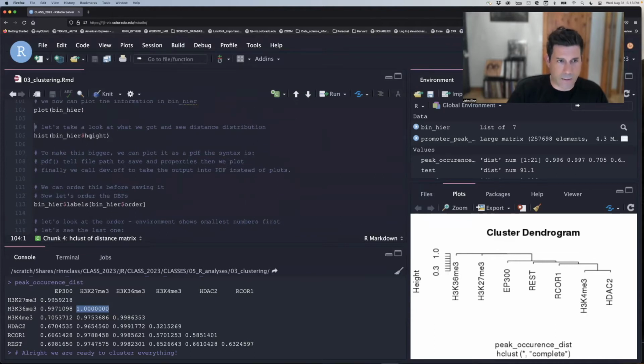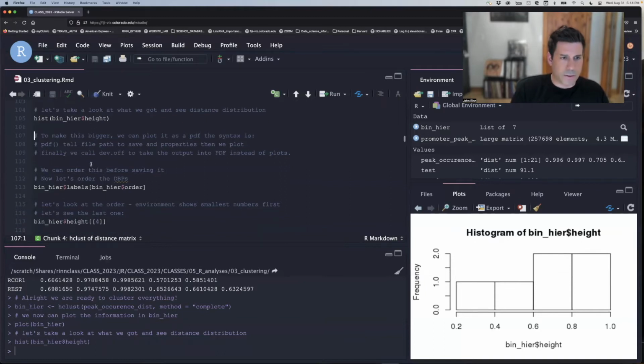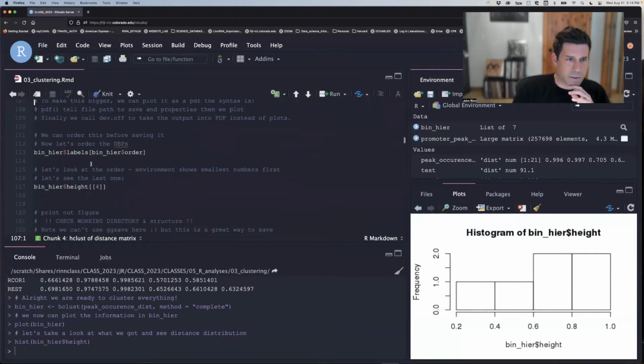And we can actually get the values from that plot if you want. There are so many programs, and we're going to go through things that will make heat maps and do the same thing. I just wanted to show you this in a base R sort of fashion. And we can see that really we do have two groups with different similarities between the heights, and this is just the distance of the branches.